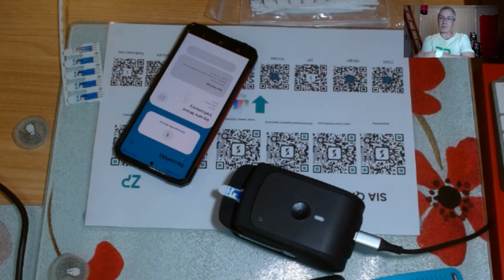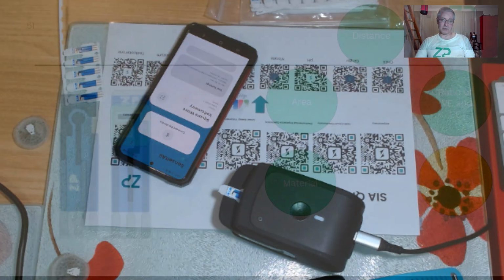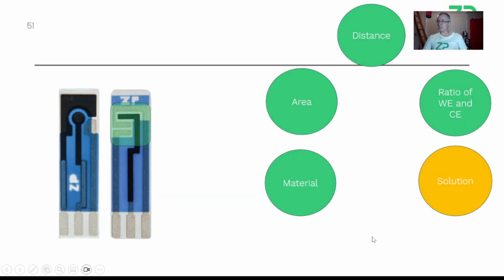So in some ways, when people are on our platform, I find it much easier. Of course, once you start saying, well, I'm going to use you in conjunction with X, Y, and Z, I don't necessarily understand the other two parts. I can only talk for what we understand. But that said, you may be using a third-party potentiostat, and that is your prerogative. It could just be hard for me to support you. We've also optimized that, in fact, we pass appropriate current. I said earlier that in some of the experiments we've been looking at this evening, there's a lot of current passing through those experiments.